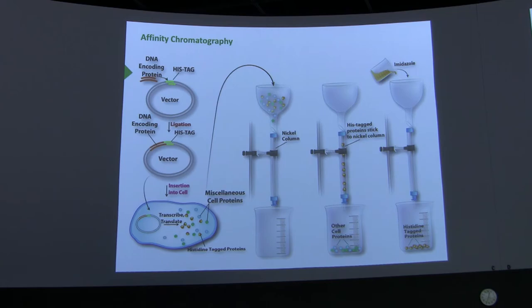Okay, affinity chromatography uses the affinity that a molecule has for a given thing on the resin. So now I've modified my resin in a specific way. Don't look at the screen for the moment; I'll tell you about that in a second. But I'm going to tell you another way. Let's imagine that I'm interested in isolating all the proteins in a cell that bind to ATP. I know they bind to ATP, and we all know that plenty of proteins bind to ATP. How do I purify those? Well, I take beads, those resins, and I attach to the outside of each resin thousands of copies of ATP. So each bead is just bursting with ATP.